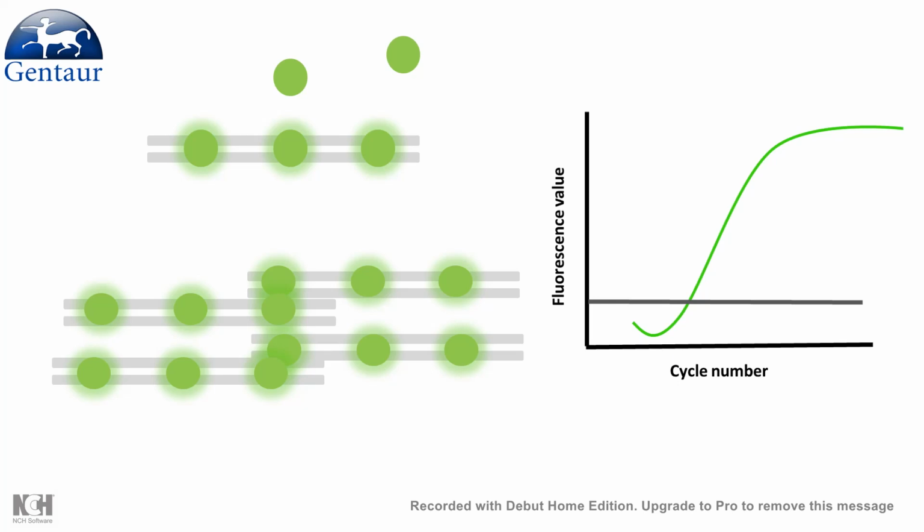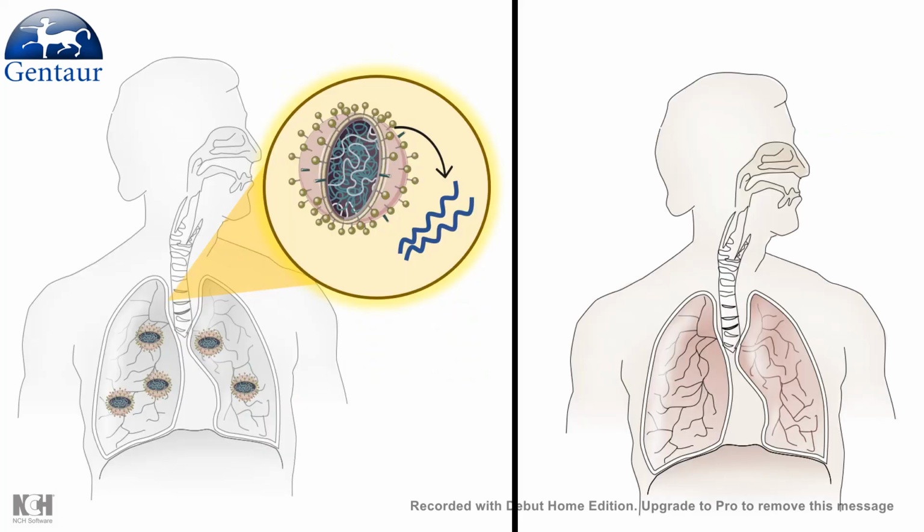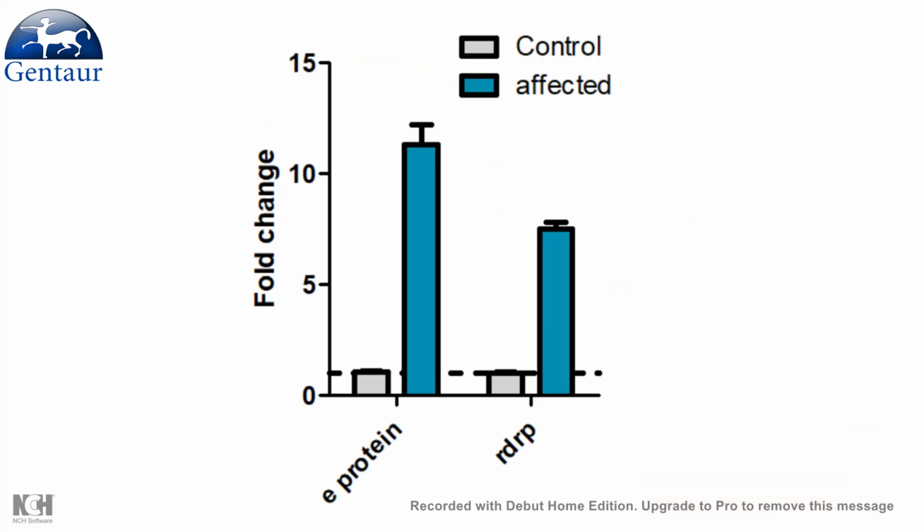Checking the quantitative value of fluorescence, we would get to know whether a particular RNA of choice is present or not. If present, how much of it is present. So all this information can be provided using this kind of assay. So taking samples from a person who is infected or suspected to be infected and from a control person who is not infected or proved to be uninfected, you can have a quantitative estimation of whether you are infected by the virus or not.